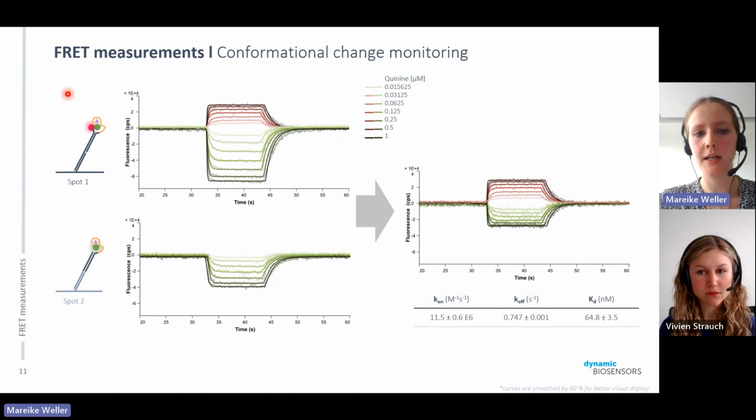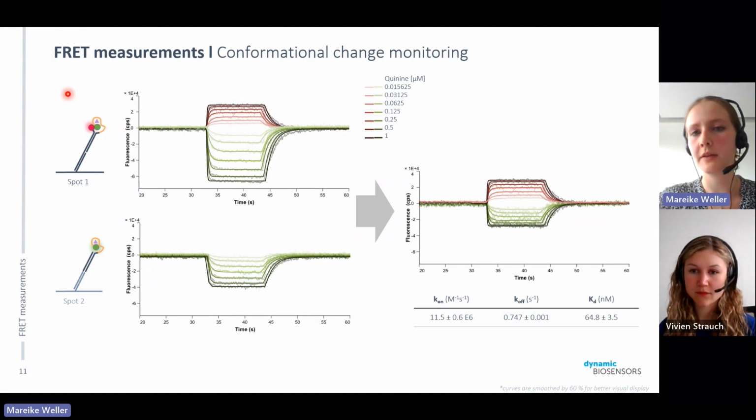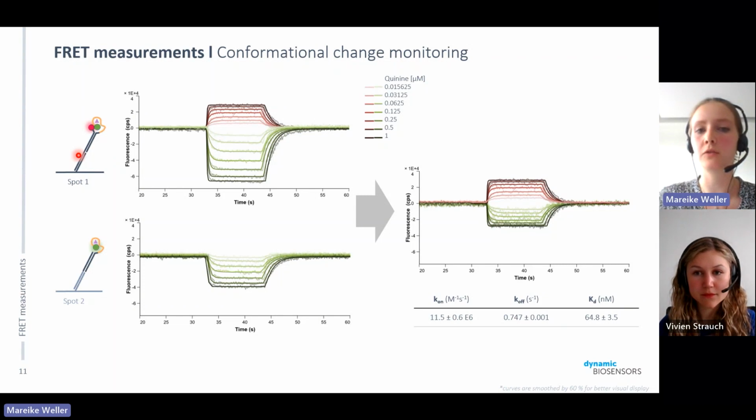Not yet, but maybe this also relates to the autofluorescence question a little bit, since we measure in a green and red range here, which are very precise for the dyes that we use. And the autofluorescence is maybe in a different spectrum. Maybe we don't see it, or if you have a single dye measurement and your compound fluoresces in green, then you can just do the measurement with the red dye, or vice versa.